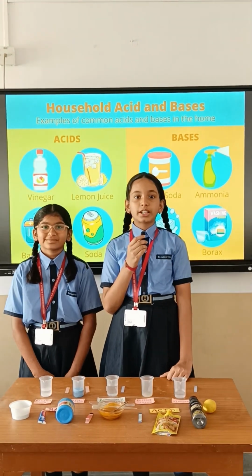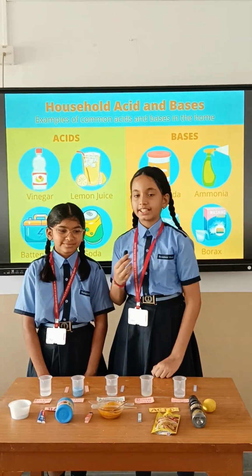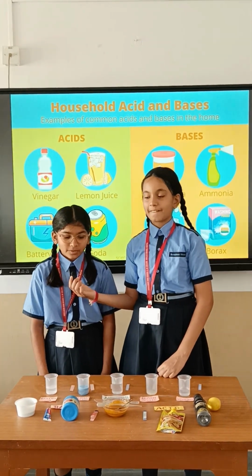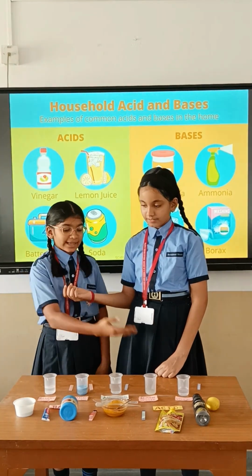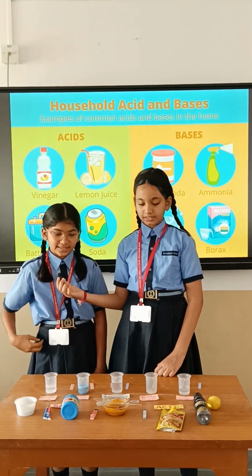Today, we are going to demonstrate acid-base experiments using natural indicators. Welcome to our color-changing mystery. First, we are going to understand what acidic, basic, and neutral substances and natural indicators are.